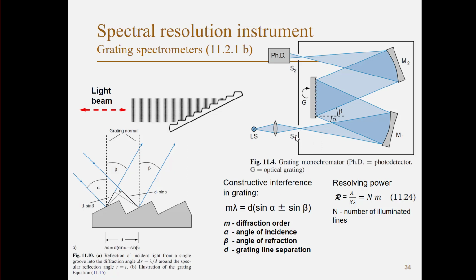prism spectrometer. The light expands out, and in the same way we want to create a collimated beam, so all the light is parallel. We do that by having a mirror in this case instead of a lens. So we are focusing the beam with a mirror over here. After this mirror we have parallel light, and here we have alpha, the input angle, and beta, the angle coming out, just the same as in this drawing down here.